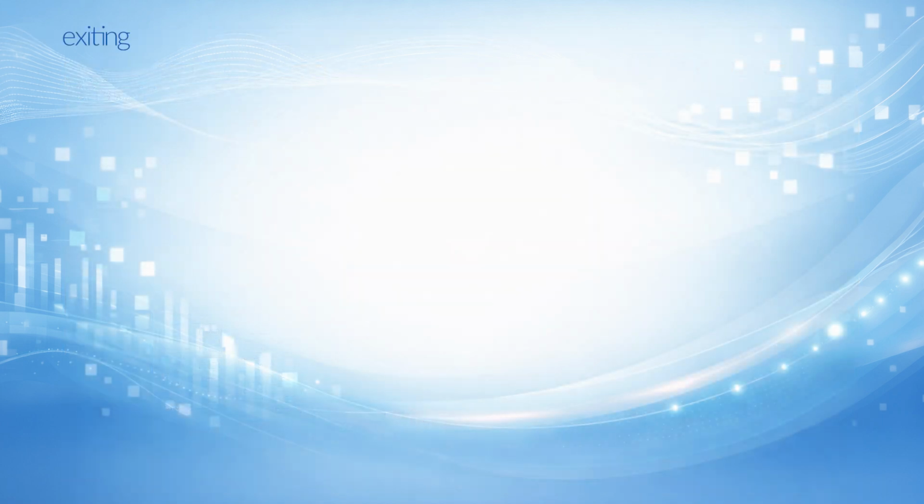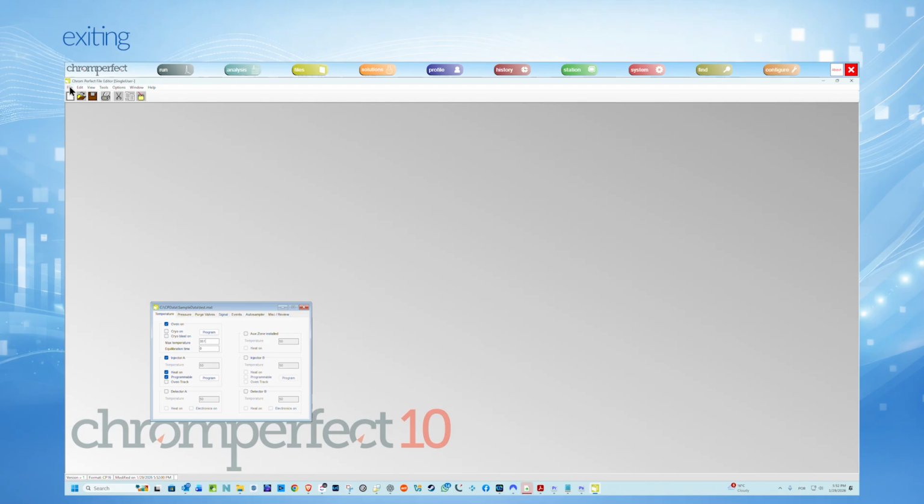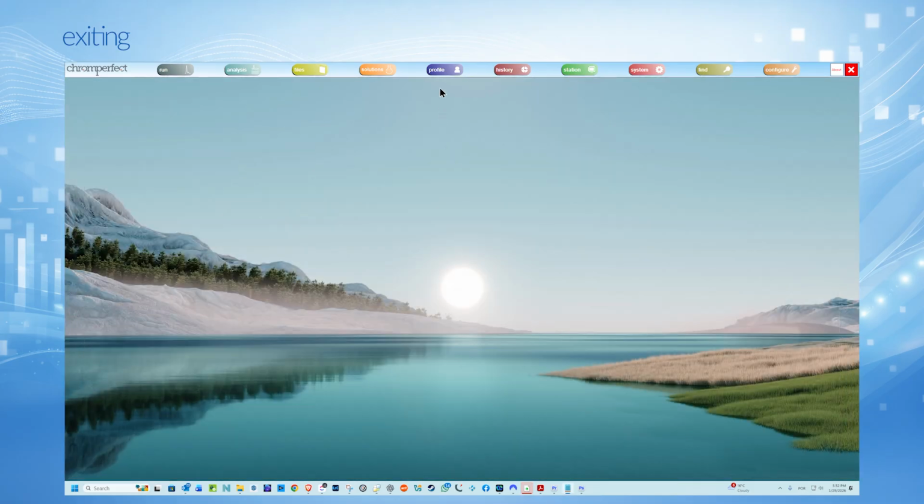Exiting the file editor. To exit the file editor, choose File, Exit. If changes exist in any open file, each form will be brought forward in turn and you will be prompted to save. If several files have unsaved changes, you will be prompted for each one. Once all editing forms are closed, the program terminates. Choosing Cancel stops the exit process and leaves all remaining forms unchanged.